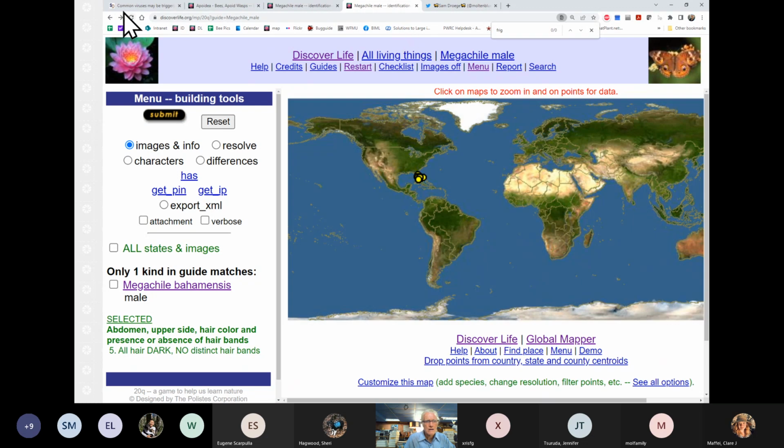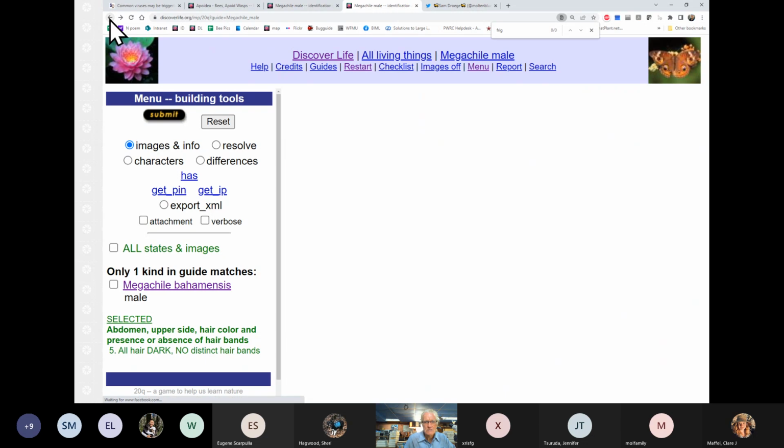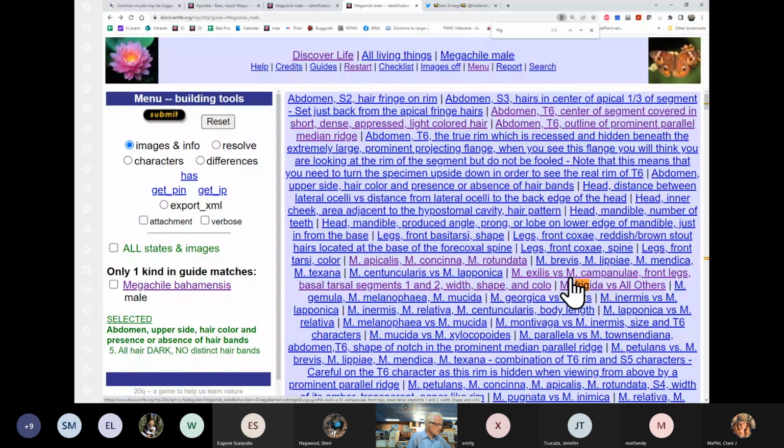All right, so now that I've gone away, I'm going to go back to, there we go. We're back on the has area. So that covers the banding. Mostly what you're discriminating in the guide are the small little clade of species that, sorry, I'm looking for my specimen here. Small little clade of species that have something other than bright white hair bands going across the plane of the top of the abdomen.